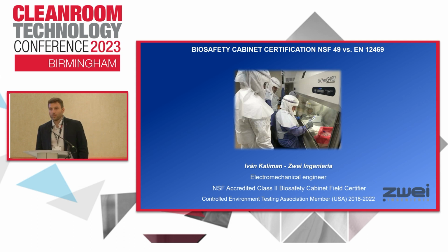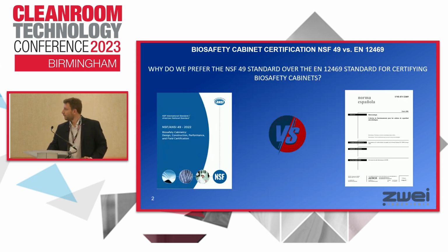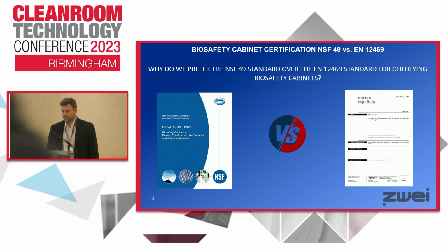Well, hello everyone. I am Iván Kaliman from Argentina. My company works in Argentina and Spain since 2008. In this presentation, I'm going to talk about why we prefer the NSF 49 standard over the EN 12469 to certify biosafety cabinets.